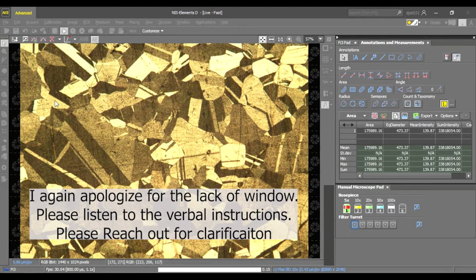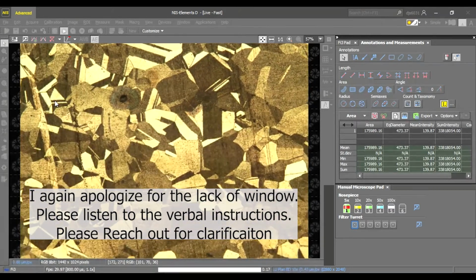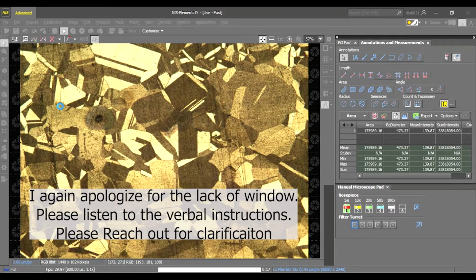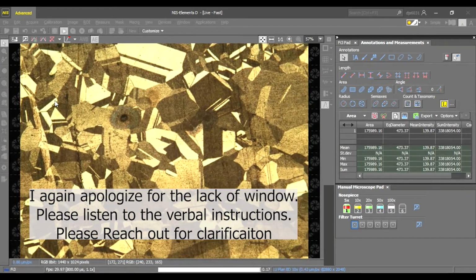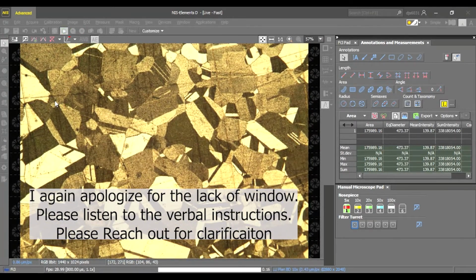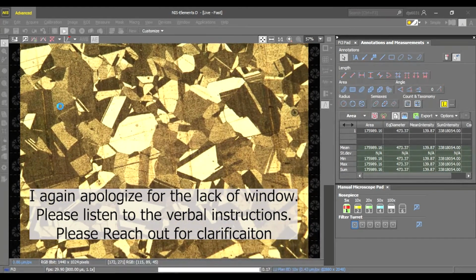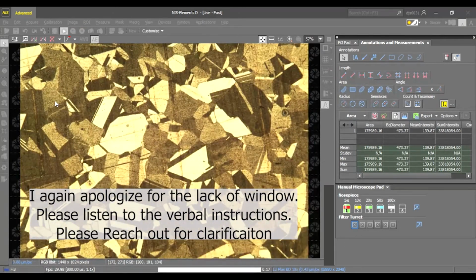But once you turn on auto capture, once the box turns purple, it means it's ready to take an image. If it's green, there's essentially too much overlap for it to automatically take an image. So you can just keep moving around. Oops. See, when it's red, there's either not enough overlap or you're going too fast. So you can just keep moving around and taking these images.